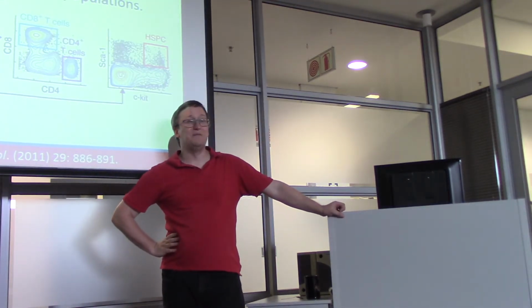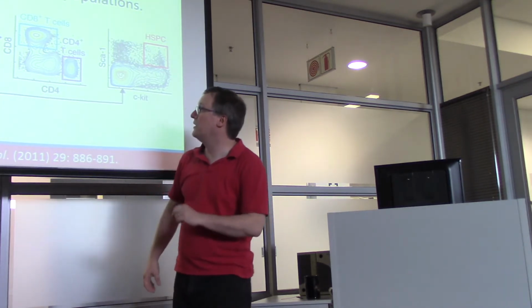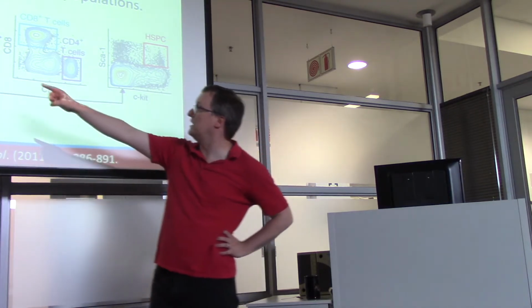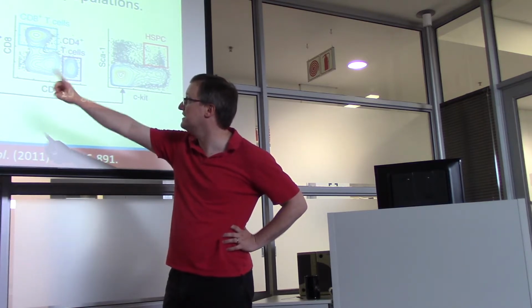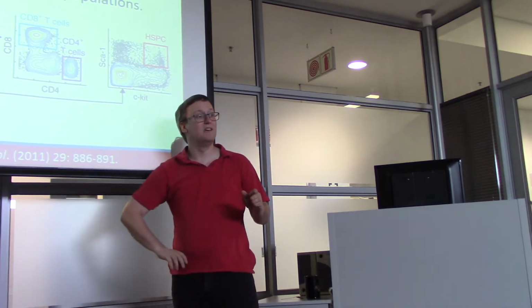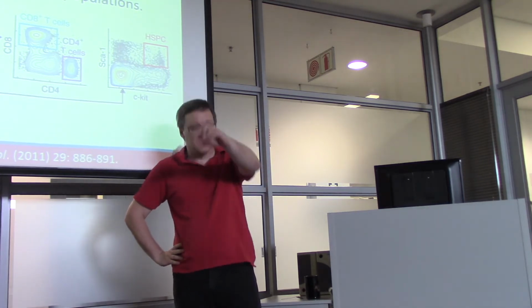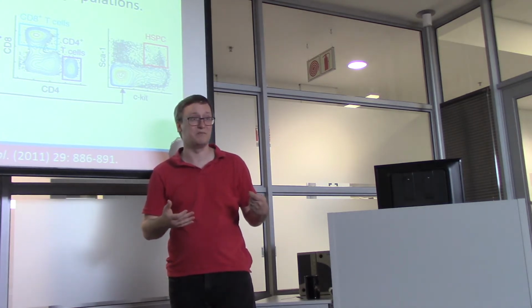Now, it gets even messier when we get into sequential gating. So imagine in this case that we have several different channels we've read. We've got CD11B, side scatter on channel A, B220, TCR beta, CD8, CD4, SCA1, and CKIT. Right? That's a lot of different channels to be measuring on these cells. But in this case, these guys are after a cell population that requires many markers for us to be able to distinguish.